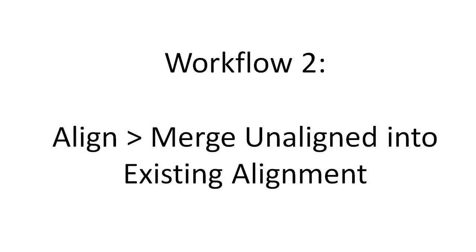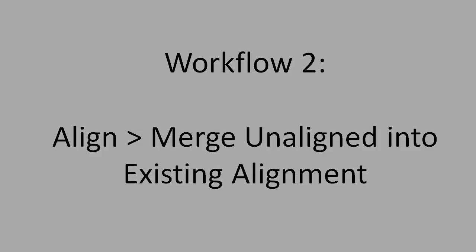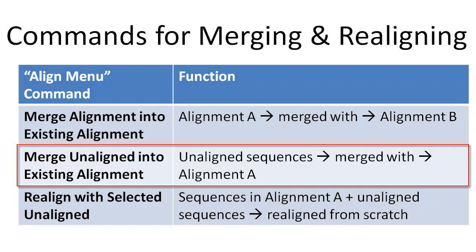In Workflow 2, I'll demonstrate the use of the Align, Merge Unaligned into existing alignment command. This command is used to merge unaligned sequences into the current project's existing alignment, and is a second type of profile alignment.